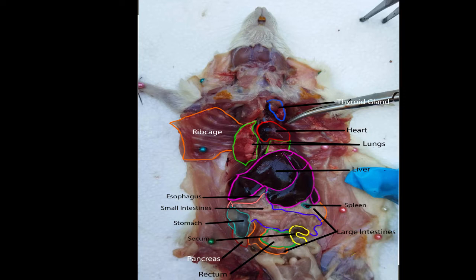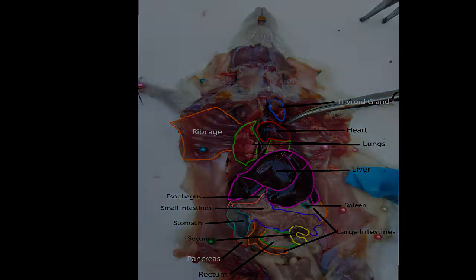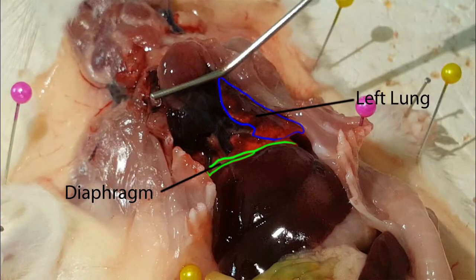The lungs are spongy organs that lie on either side of the heart and should take up most of the thoracic cavity. The diaphragm is a layer of muscle that separates the thoracic from the abdominal cavity.